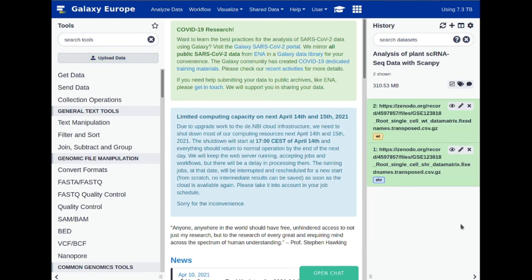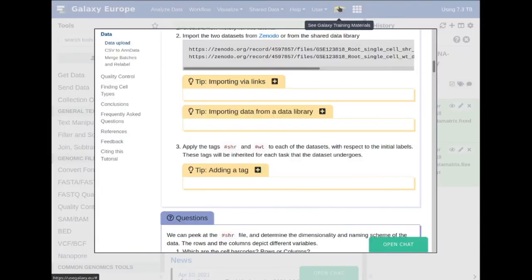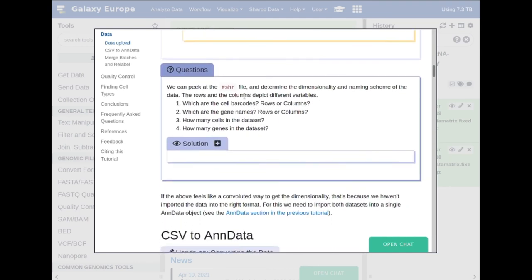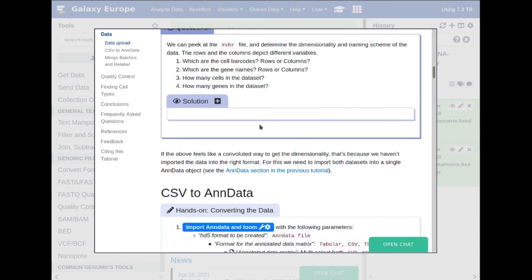Now let's go back to the tutorial. We should now have these two datasets with their SHR and WT tags added. If you wish, you can expand the datasets to see exactly how many cell barcodes there are, what their gene names are, how many cells are in the dataset, and how many genes. This is something you can do in your own free time if you're curious about the dataset.